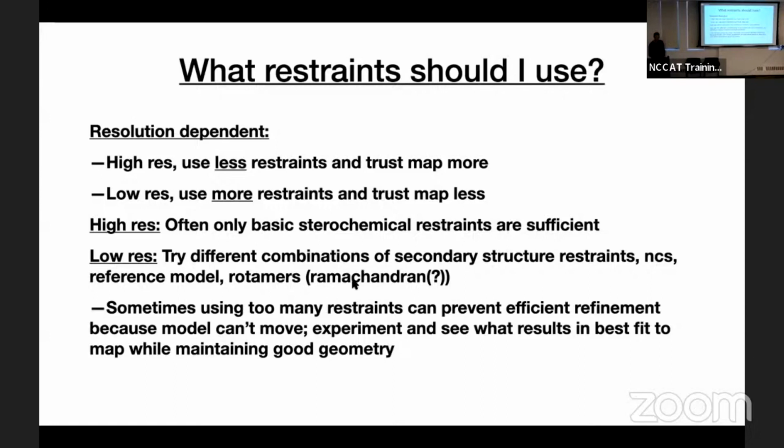So the Ramachandran restraints, I agree, I would leave off early in refinement. If everything is good, I'd say you could leave them off to the end. It's not like you need to ever use them, but if, after having corrected areas, you're having problems where residues keep slipping back into disallowed parts of the Ramachandran plot, then you can put this on to help hold things in place.